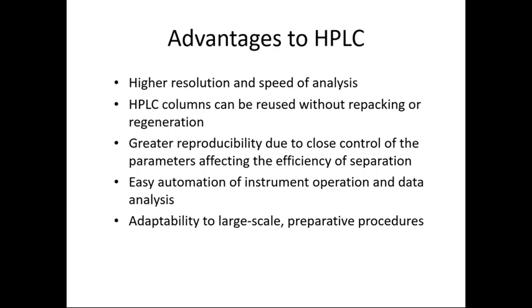The only tedious and time-consuming procedure in HPLC is the sample preparation. After sample preparation, everything is automated. And you can upscale this to preparative procedures and also use this to isolate and prepare pure compounds.